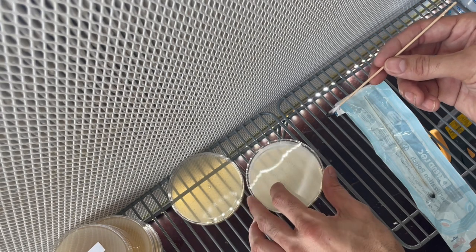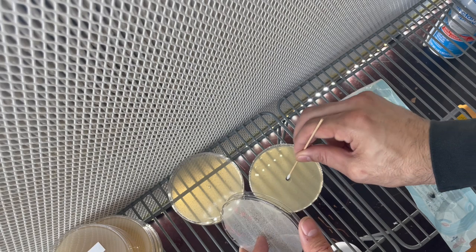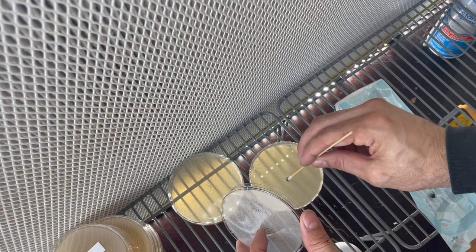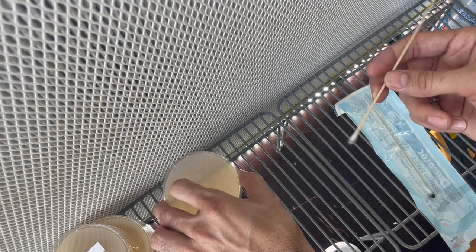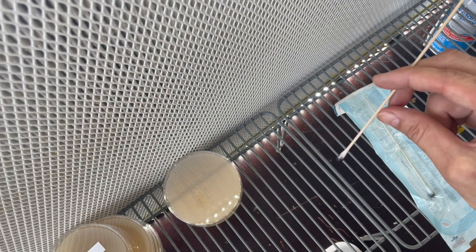We'll do it once more — really get it in there. Make sure you get a nice dip. Then you'll place your swab right back in your packaging.